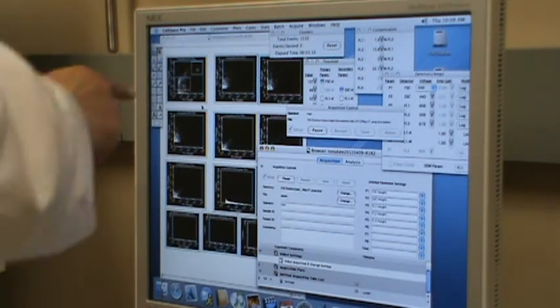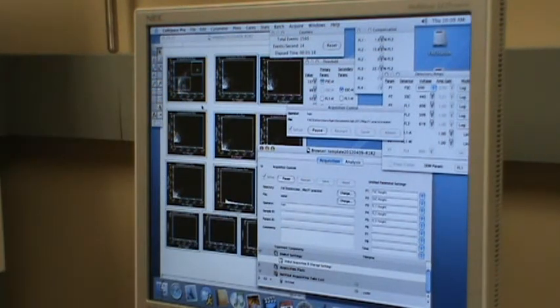So the side scattering is proportional to what they call the granularity of the cell. They're kind of like a diamond that's very clear that can reflect a lot of light versus one that's kind of dingy. Philosophically it's similar, but actually it's not the same. I forgot the physics concept of that.